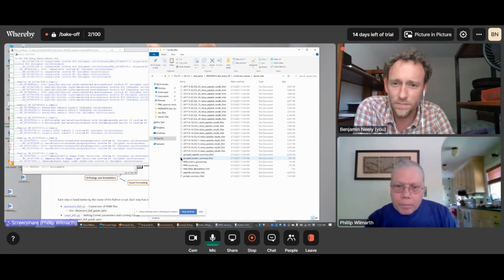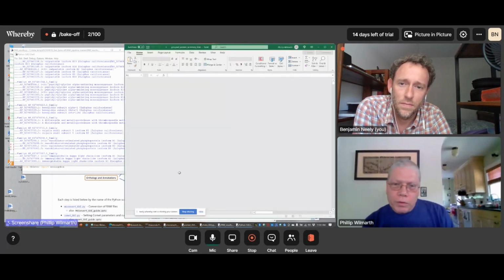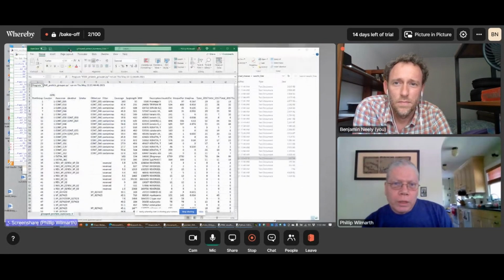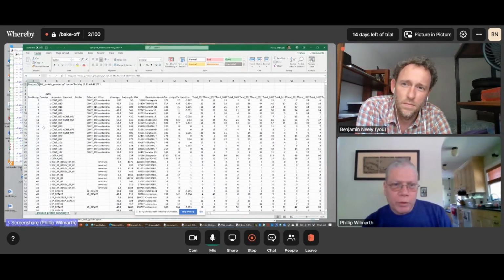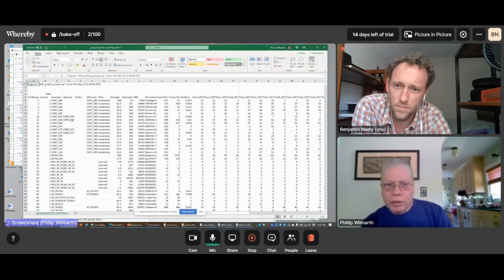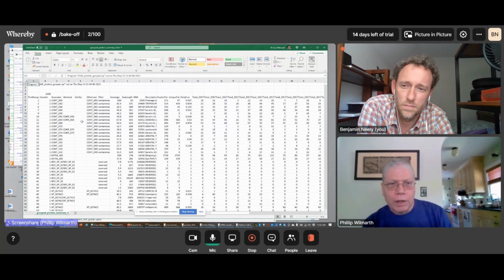Right. And we can open up the descriptions of what kind of results files are written by the pipeline, and what the different columns are in the tables. But here we can see that the data is your basic proteomics results table. So we've got some arbitrary protein group number, we've got our protein accessions, we've got some kind of summary here of those parsimony analysis, protein inference, and protein grouping steps. So if proteins were identical, we see that there are other accessions associated with it. And if the proteins were similar, meaning the things that we got together in the grouping algorithm, those get written at the bottom of the table. So we don't see any entries there.